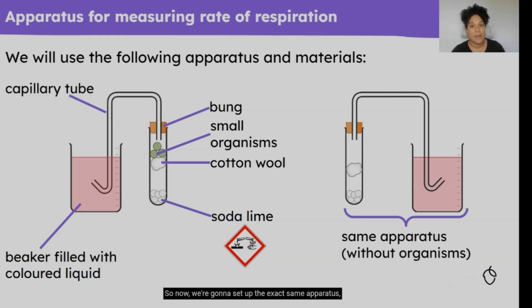So now we're going to set up the exact same apparatus, but it's not going to have those small organisms in it. And I'm going to explain why that is at a later part in the lesson. Right now, I just want to talk about how to set up the equipment, okay? But it's okay if you don't understand why we have almost exactly the same setup on the other side of the water bath. Don't worry about that now. I promise I will explain it.